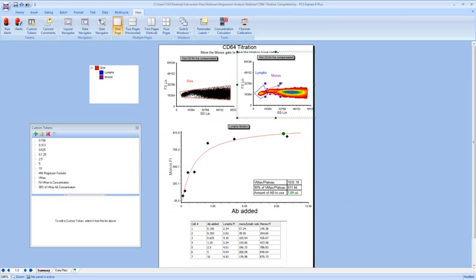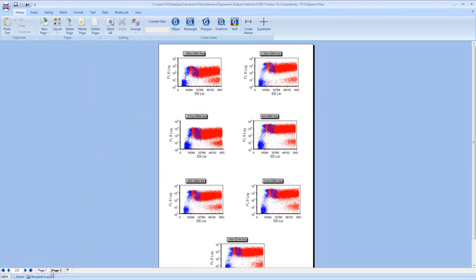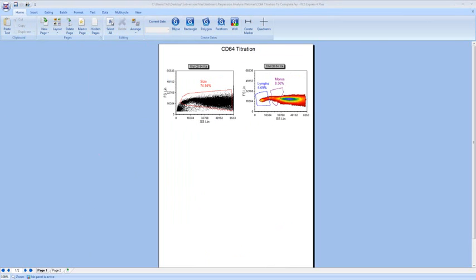All right. Another nice thing to notice about this plot is that our concentrations are actually stored as keywords here. So what we're going to do today is recreate this analysis to show you how to set up custom regressions in FCS Express. And I have a basic starting point here with our gates set up. And you can see on the second page here we have all of our plots. So let's just go right ahead here.